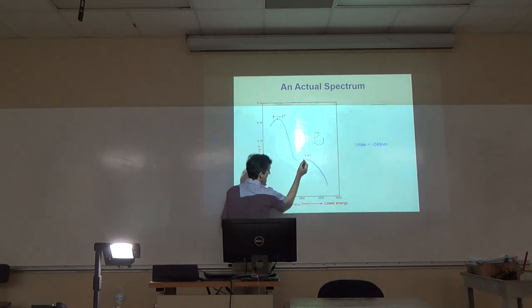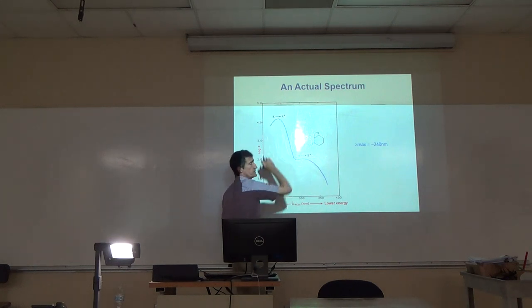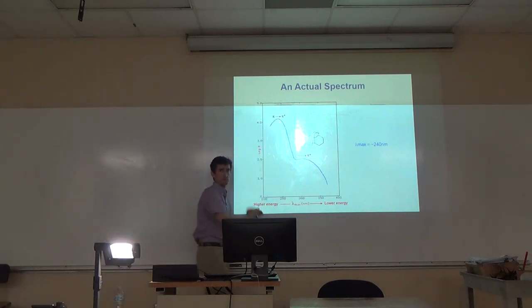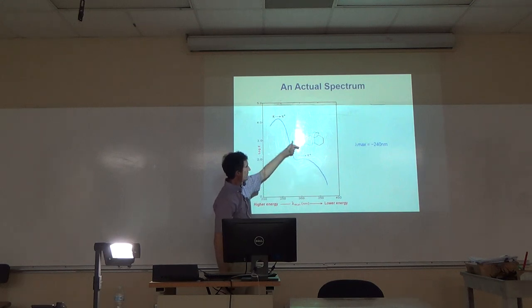It tails off. Right here, it's like something else is going on. It's not just sort of tailing off from this maximum. It's almost like something else happened. Well, it is. Two things we can say here. Your pi to pi star transitions tend to be most intense. Pi to pi star tends to be your lambda max. Over here, somebody has ascribed this to probably the n to pi star transition, where the lone pairs are being excited to a pi star.